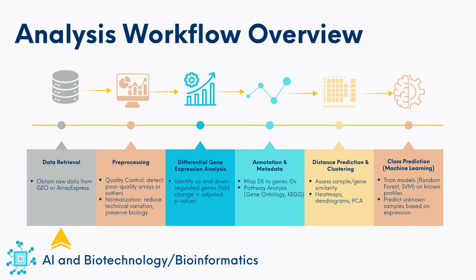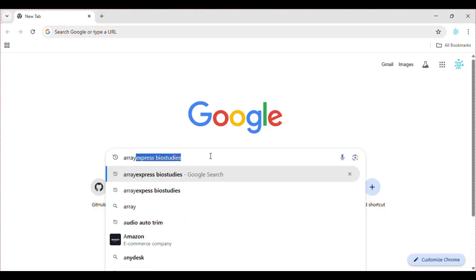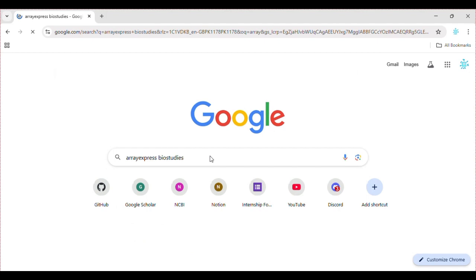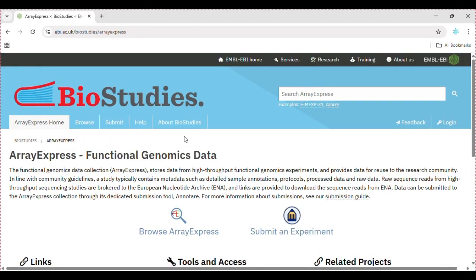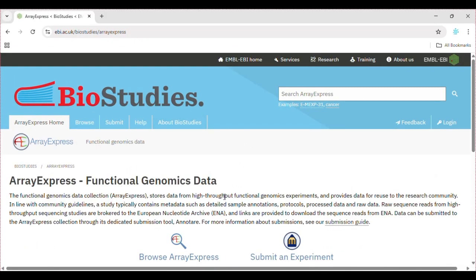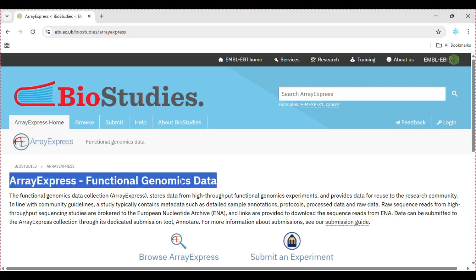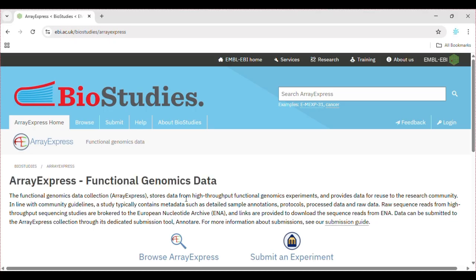Now that we know our first step is data retrieval from public databases, let's start with ArrayExpress. Open your web browser and search for ArrayExpress BioStudies, then click on the link that takes you to the ArrayExpress homepage within the BioStudies database. ArrayExpress is a public archive hosted at EMBL-EBI, the European Bioinformatics Institute. It was originally designed to store microarray experiments, but over time expanded to include many other functional genomics datasets such as RNA sequencing, methylation arrays, and proteomic profiling. Since 2022, ArrayExpress has been fully integrated into the BioStudies database.